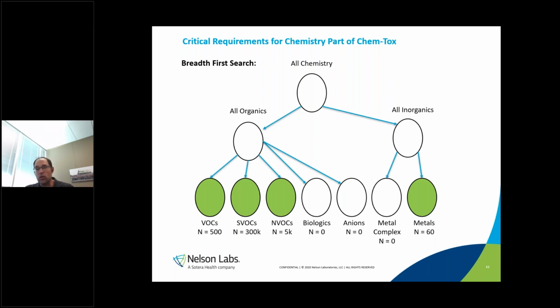So based on your change, we might be able to identify a certain chemical technique instead of running a full-blown extractable leachable based on what's changing in your device. If you're adding a stabilizer, and we can look at the composition of that stabilizer, we may recommend a certain chemical technique, not the whole one, to evaluate the leachable profile of that stabilizer, and then the tox profile. So it could be something that's quicker and cheaper than running a full-blown extractable leachable based on the change itself.